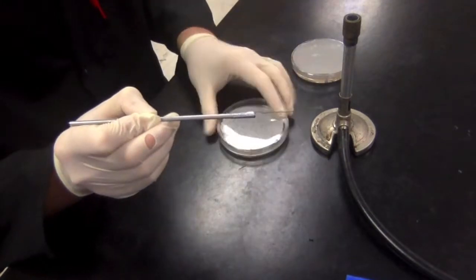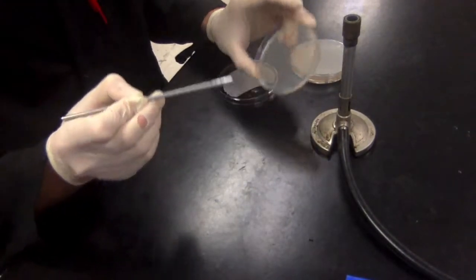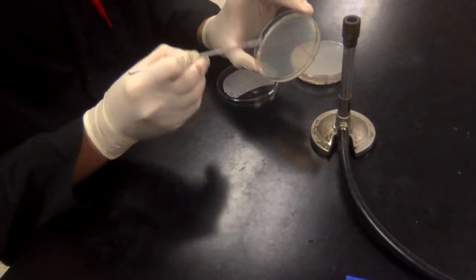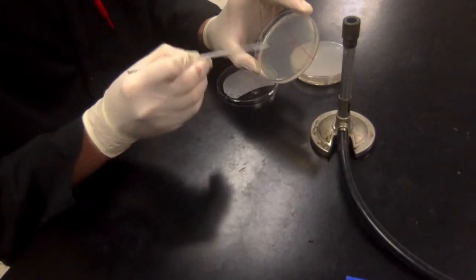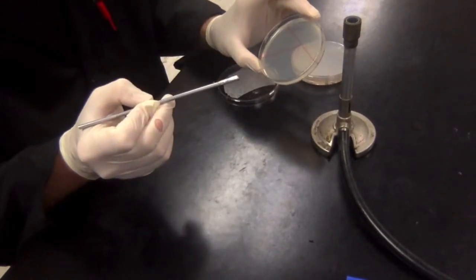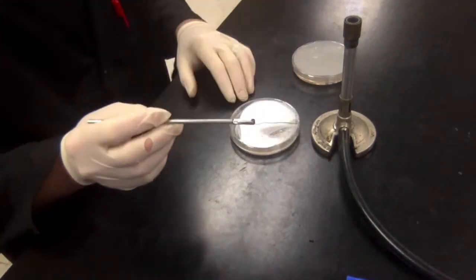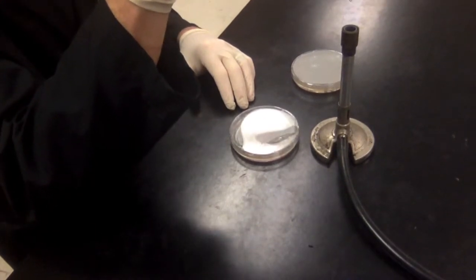I'll take the lid off and basically color in this entire left segment of the plate, running the loop back and forth lightly across the surface of the agar, smearing the bacterial growth I picked up all over that quadrant and nowhere else on the plate.